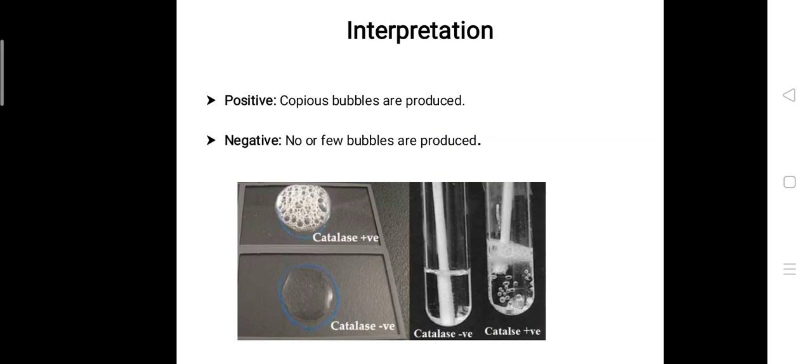Whereas for negative results, the absence or very few bubbles are observed. This means the organism does not have catalase present in them.